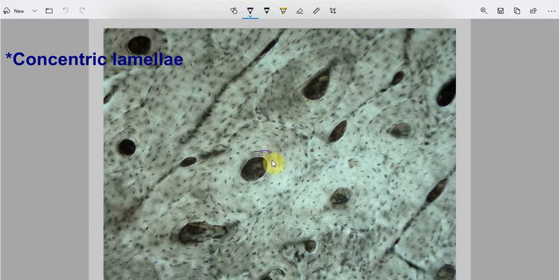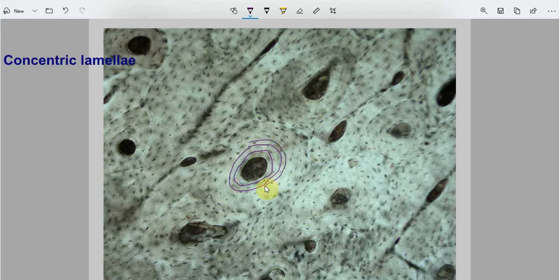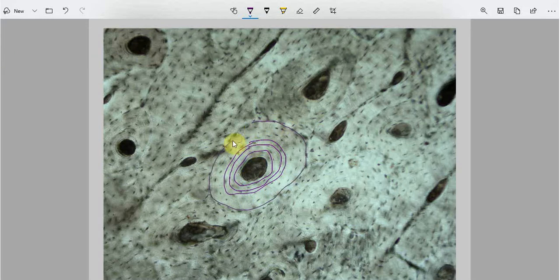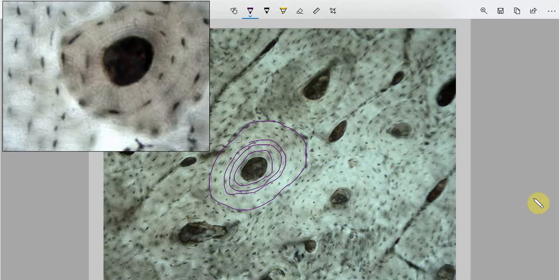You can see here these layers are in a circular pattern. They are known as concentric lamellae. This is the outermost layer. Here is another concentric lamella, and there are multiple concentric lamellae visible throughout. Now you can see the concentric lamellae on higher magnification.